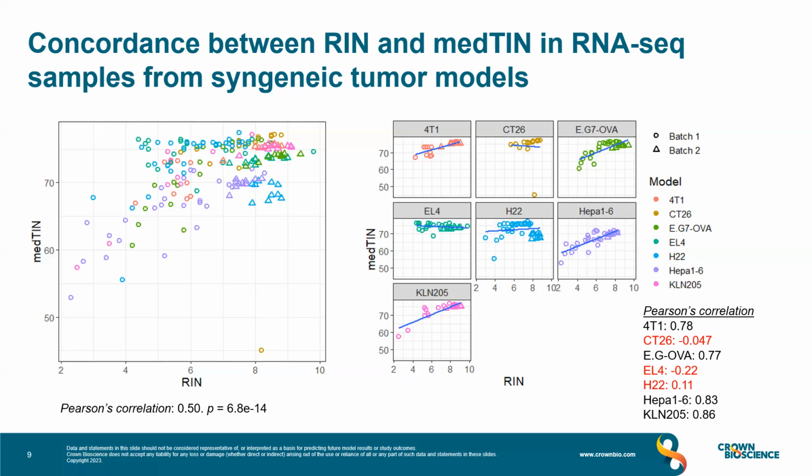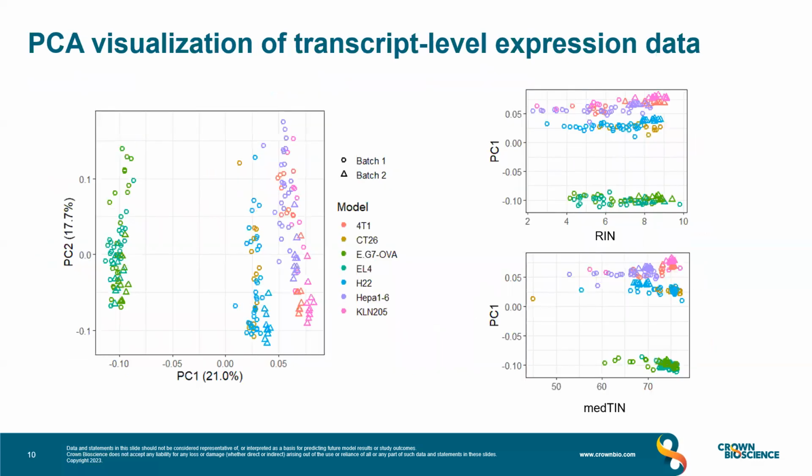Although excluding low-quality samples certainly works when the experiment can be easily repeated, we are aware that there might be situations where the samples of interest are extremely hard to come by, and one has to work with RNA samples that have undergone some form of degradation. For that reason, we also wanted to find out to what extent RNA degradation would impact the results of downstream analysis.